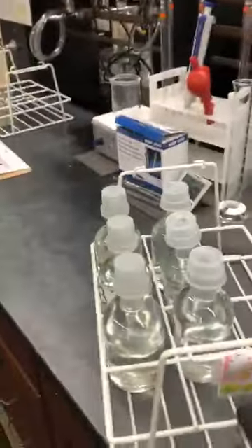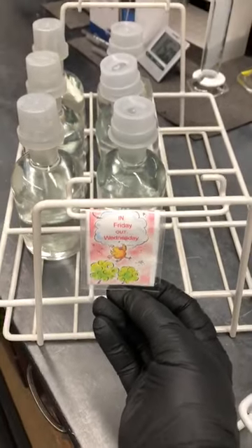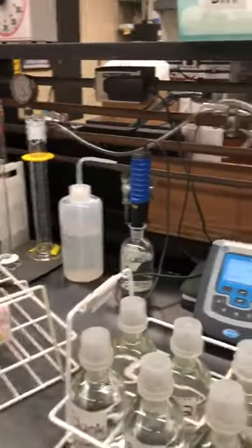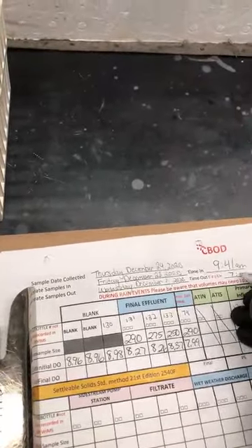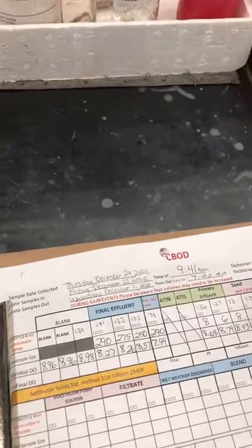It's going to be a set of these flaxseed bottles. I already took the one, but I'm going to read it right now. I'll make sure I have the right one in here — it says in on Friday, out on Wednesday. Today is Wednesday. The time is 7 o'clock. I write down the time: 7 a.m., and my initials.